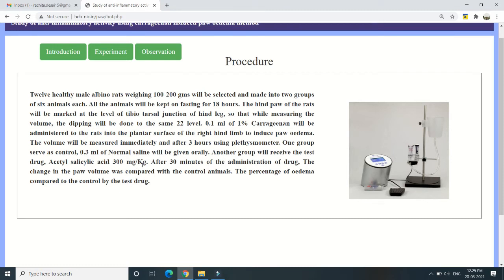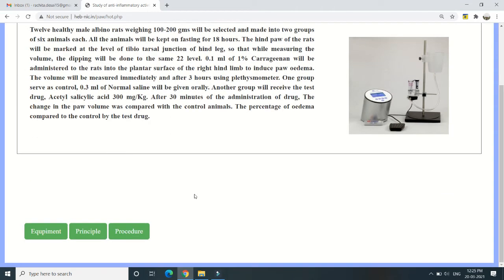After 30 minutes of drug administration, the change in paw volume will be compared with the control animals, and the percentage of edema inhibited will be compared to the control group by the test drug.